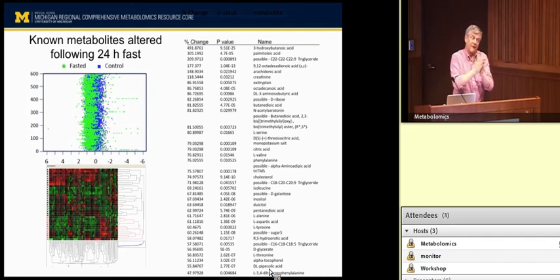If you find a very high correlation between a presumptive lipid in the untargeted platform and a lipid identified in the lipidomics platform over a number of samples, and they co-vary to a high degree, you have a much higher likelihood, especially if the masses are similar, that this is the same thing. Then you can do some other things to specifically identify what that unknown in the untargeted platform is. And you can do it the other way around: find known things in the untargeted platform and hopefully find them in the lipidomic platform, because the chromatography is different, but not so different that you shouldn't be able to do it.